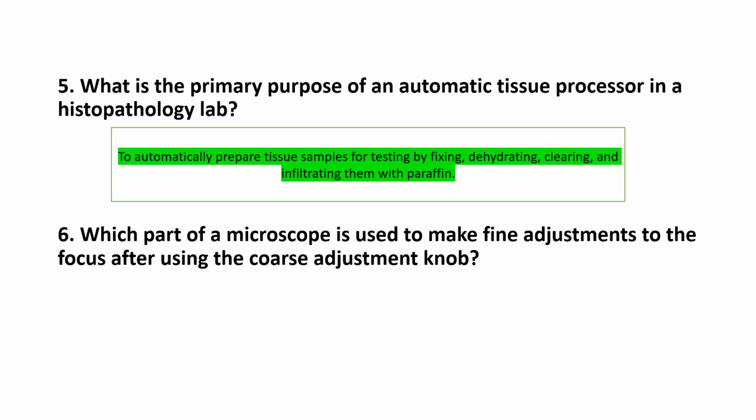Number 6, which part of a microscope is used to make the fine adjustments to the focus after using the coarse adjusting knob? And I would love to mention that the microscope is also an indispensable tool in the diagnostic laboratory, because it helps us deliver the diagnostic function of the lab. That's why we find it in many of the laboratories. In histopathology, we have the microscope. In parasitology, we need to have the microscope. In hematology, even in blood bank, the issues of cross-matching, and also even microbiology, right? We need to have the microscope. It's a very, very important diagnostic feature.